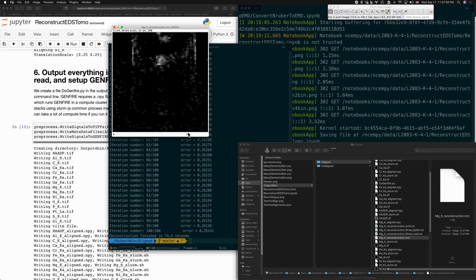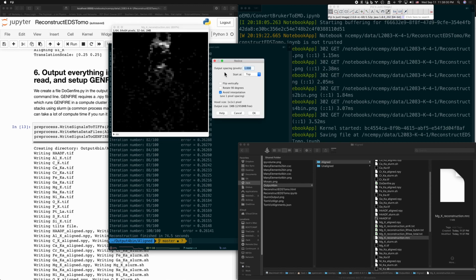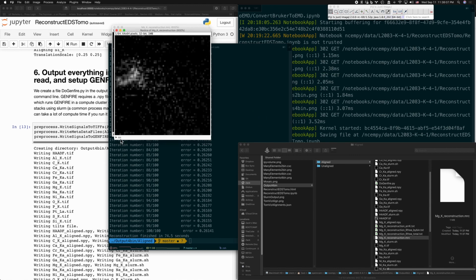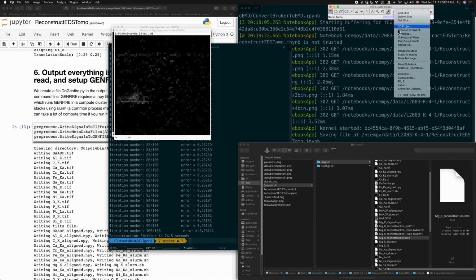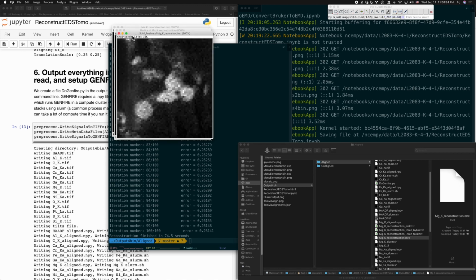So this is coming at it from the side. You might, for example, slice this from the left and come at it this way, and you can see it better there. I'll just project this so you can see it. So that's looking through the entire reconstructed stack.